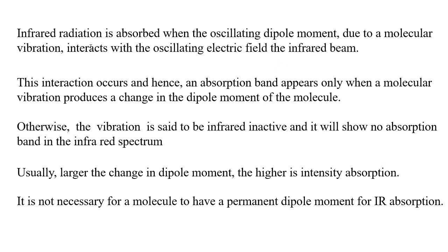That means the infrared absorption takes place only when the oscillating dipole moment created by the molecule due to the molecular vibration interacts with the oscillating electric field of the infrared beam.